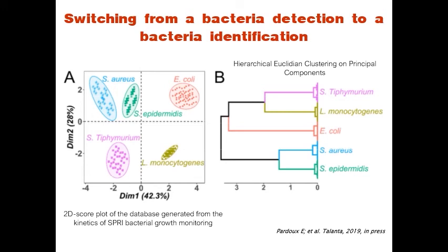These experiments on different bacterial strains interacting with the same set of AMPs gave clustered results as shown on the PCA 2D score plot. Those clusters of data points were well segregated from each other according to the monitored pathogen. It thus confirmed the suitability of this approach for bacteria identification, at least for the set of bacteria tested here.